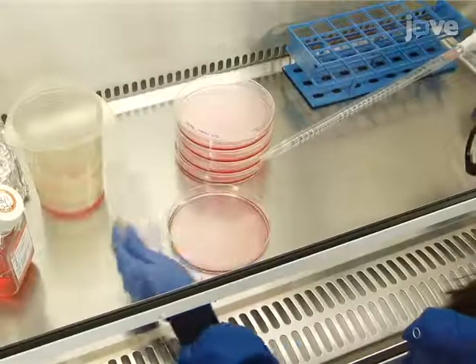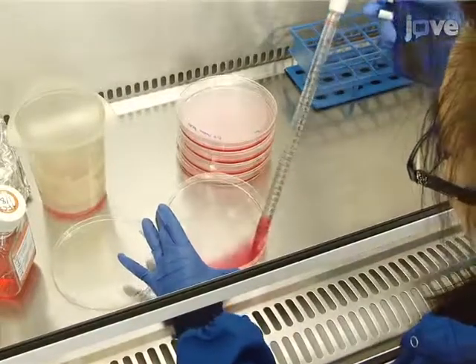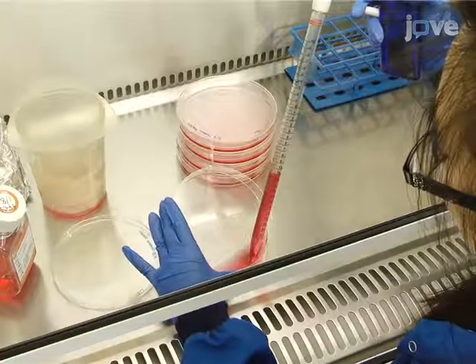Three hours before transfection, remove the DMEM and replace with Iscove's Modified Dulbecco's Medium, or IMDM, containing 5% fetal calf serum.